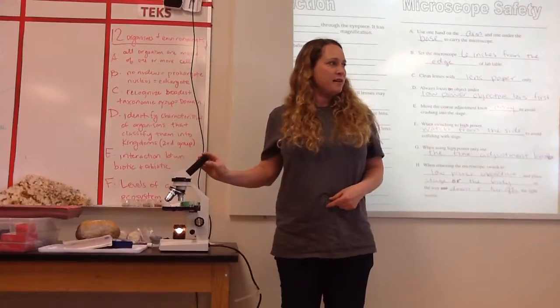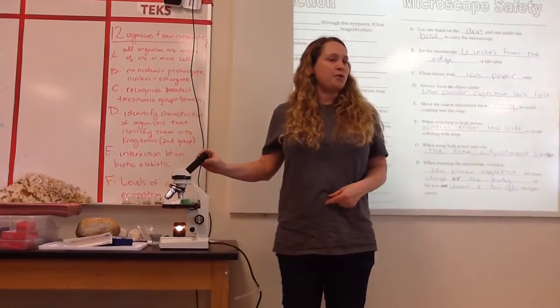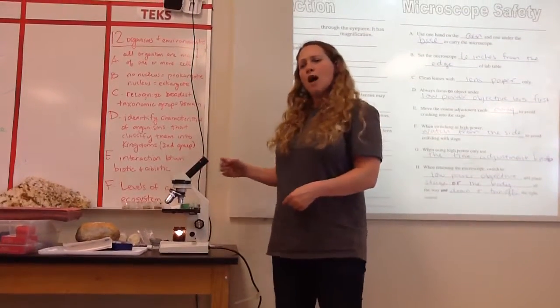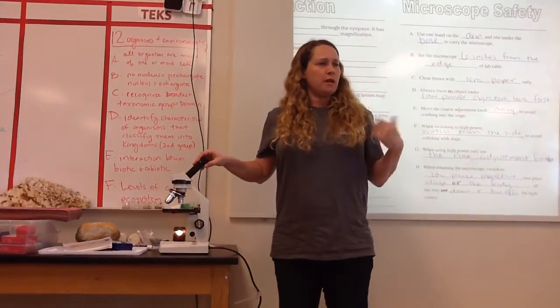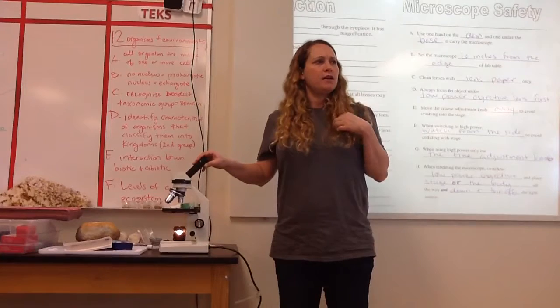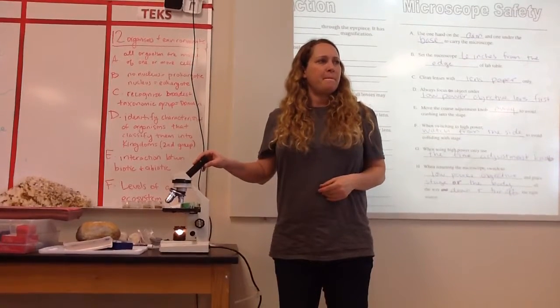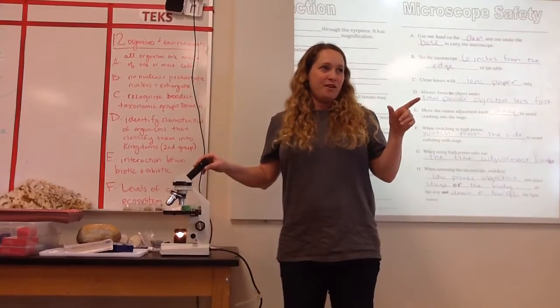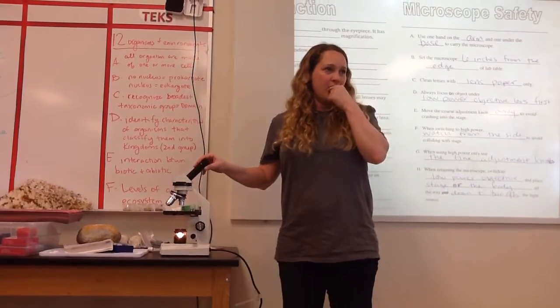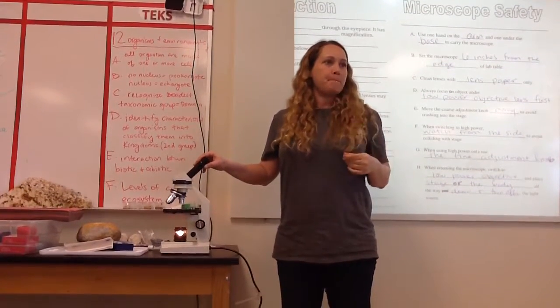Joshua, do you know? It kind of is an optical illusion. Why is it happening? Why, when I push right, would it go left in my picture? The glass? Something to do with the glass, Lauren? Maybe because it's magnified. It is about magnification. Okay. It is about magnification. Jack? It's a mirror, so that it's opposite every time.